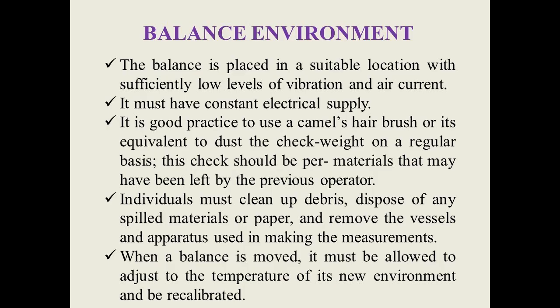Allow the balance to stand for 30 minutes to match temperature. Use a camel's hair brush or its equivalent to dust the check weight on a regular basis. This check should be for materials that may have been left by the previous operator.